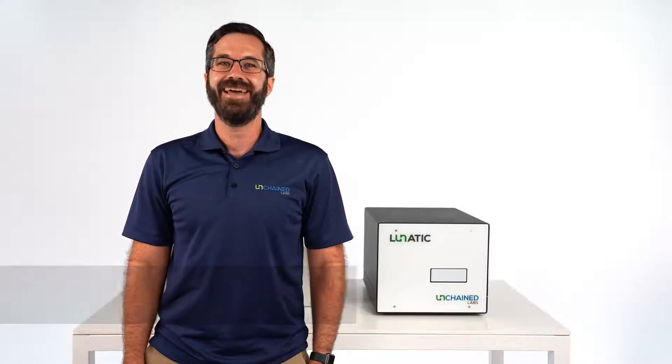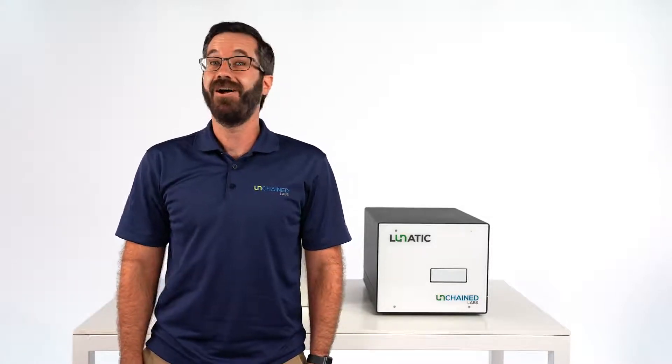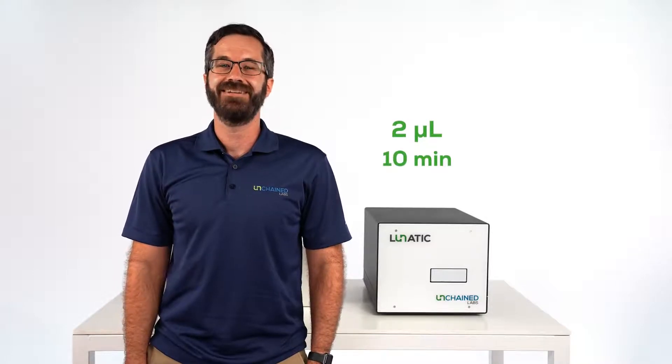Lunatic makes batch quantification of DNA and RNA a no-brainer. All you need is two microliters in 10 minutes to measure up to 96 samples.